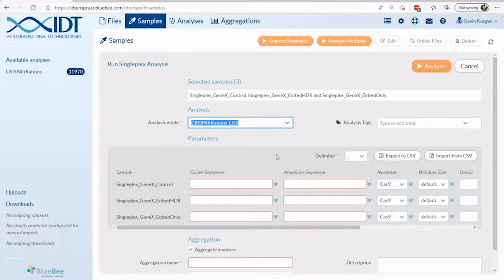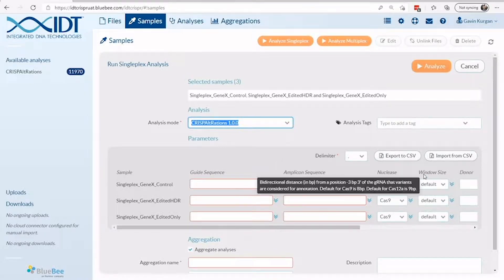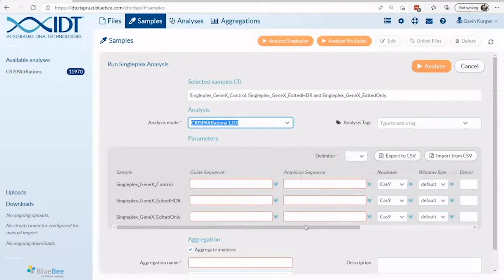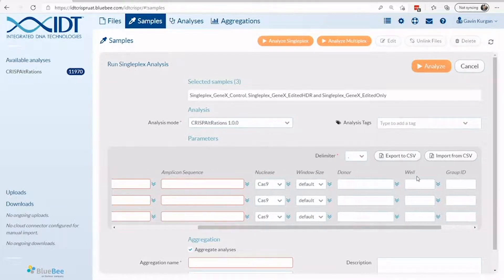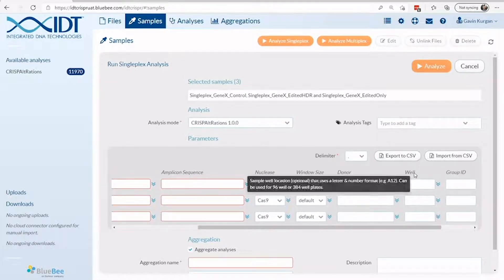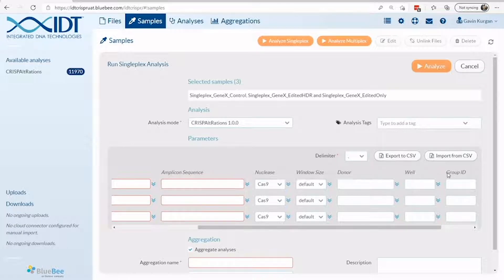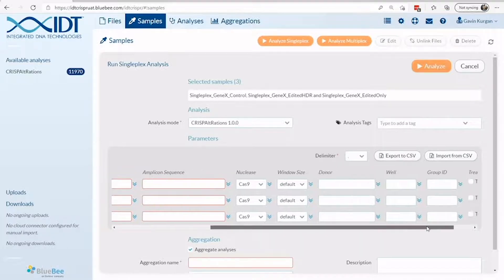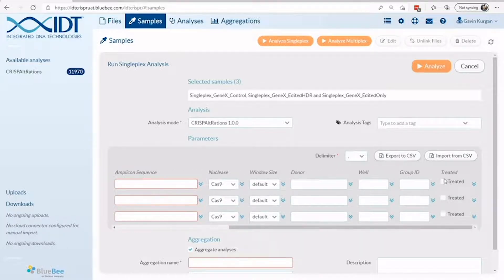Additional parameters can be configured on a run, including the CRISPR nuclease used, the window for interrogating variants, nucleotide sequences for HDR donors used, well position information, sample name information, and whether it was a treated or untreated sample.